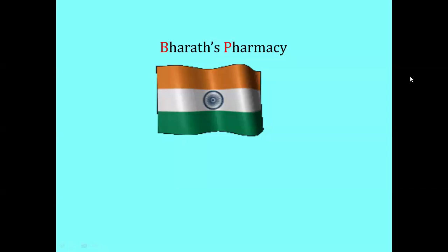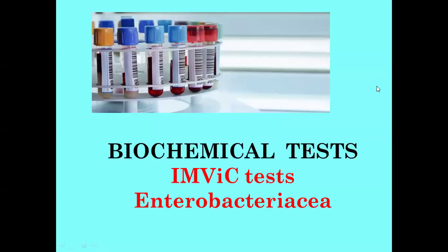In this video, I'm going to explain the IMViC test in brief, with a quick outline. This is one of the biochemical tests used in the identification of bacteria. There are various identification techniques, like staining and biochemical tests. A small part of the biochemical tests, very widely used for the identification and differentiation of Enterobacteriaceae, is called the IMViC test.